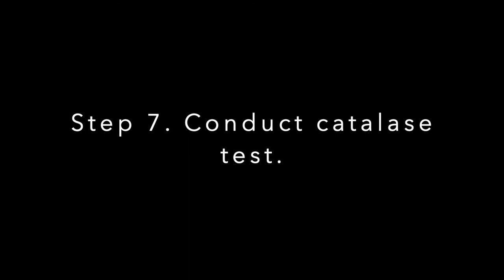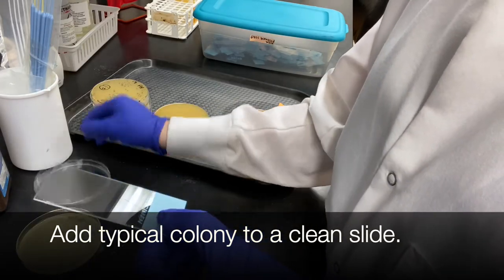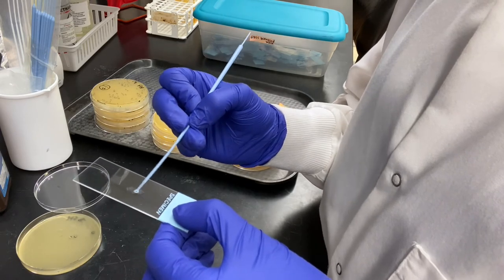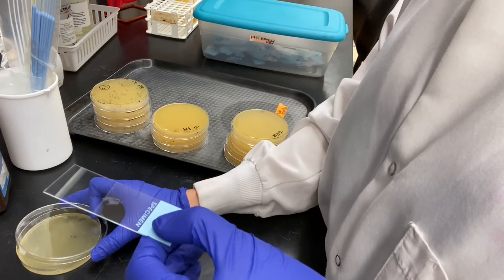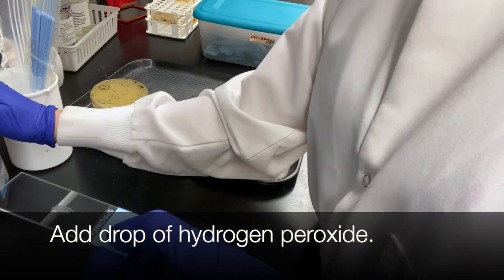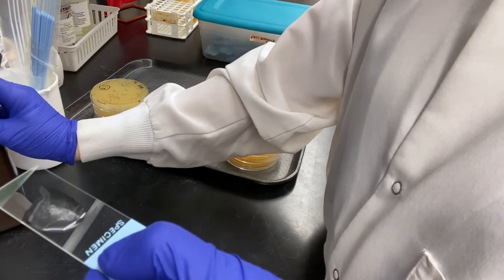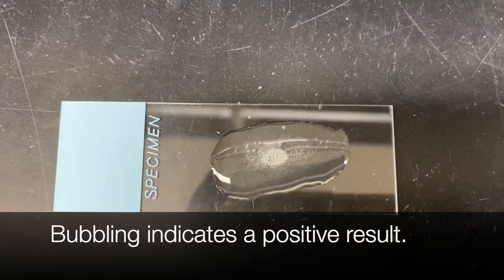Step 7 is to conduct the catalase test. Add a typical colony to a clean slide. Add a drop of hydrogen peroxide to the slide. Bubbling indicates a positive result.